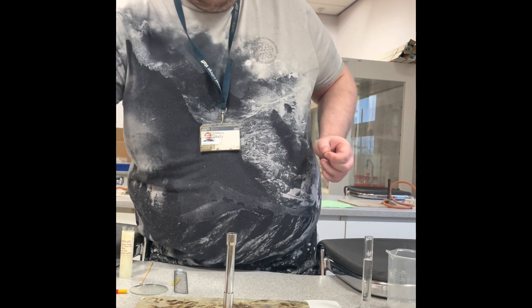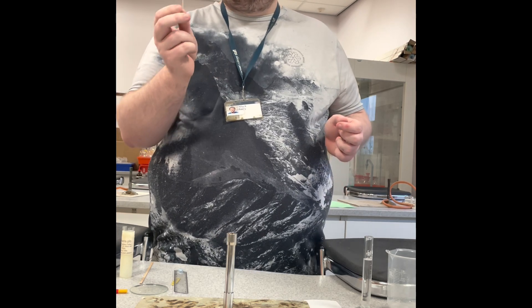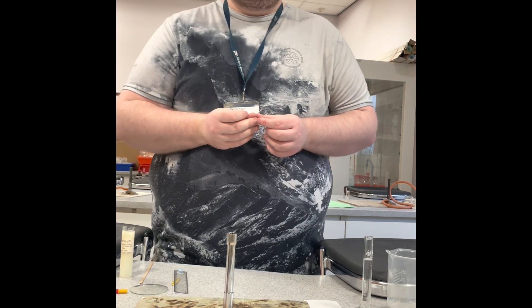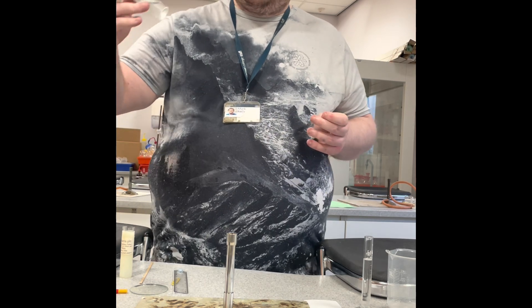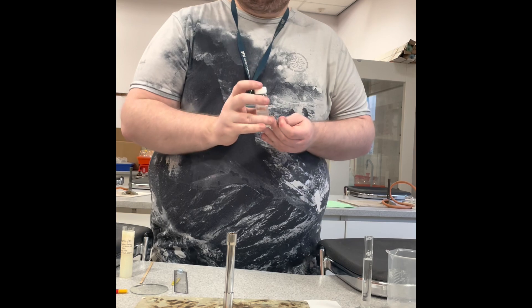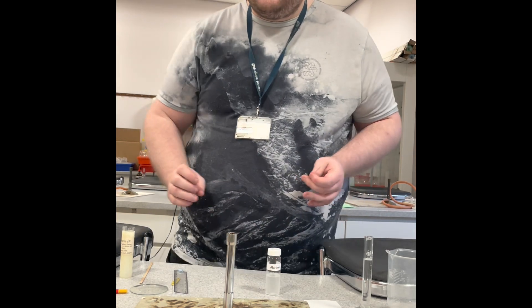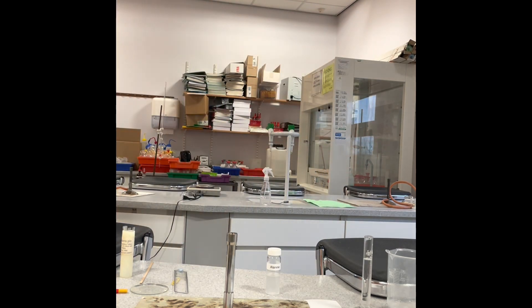Now, using the capillary tube you've just made from the Bunsen burner, we're going to dip it into one of the solvents we're testing and start putting small drops onto the chromatography paper itself.